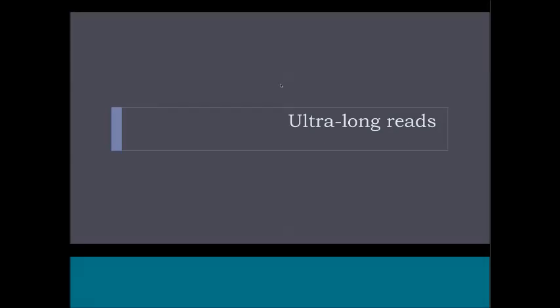One of the more interesting developments within the past few years, we actually just last week, is on nanopore sequencing and its ability to sequence what we're calling ultra-long reads. So the PacBio read lengths from those projects that I just presented were on the order of 10 to 20 KB N50 read lengths, which are kind of the current best you can do with PacBio technology.